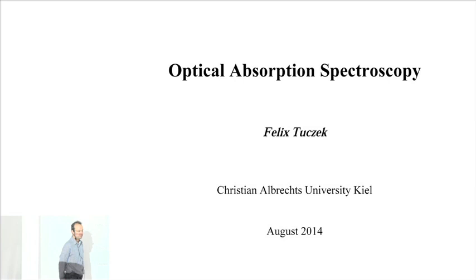I was already at this meeting last year and gave a talk entirely about MCD spectroscopy. But the organizers decided that maybe this was a bit too special and it would be better to first focus on optical absorption. So I will mainly deal with optical absorption, but in the last part of my talk I will speak about MCD.